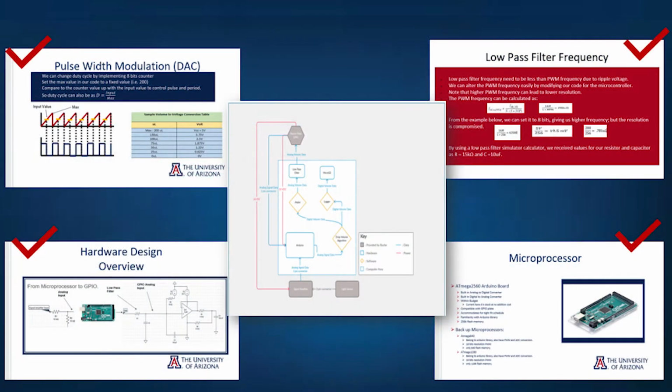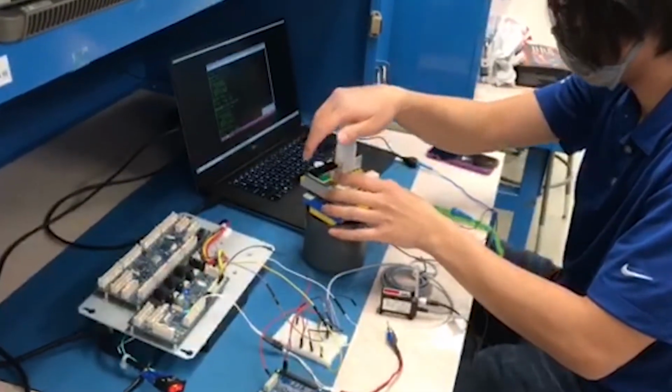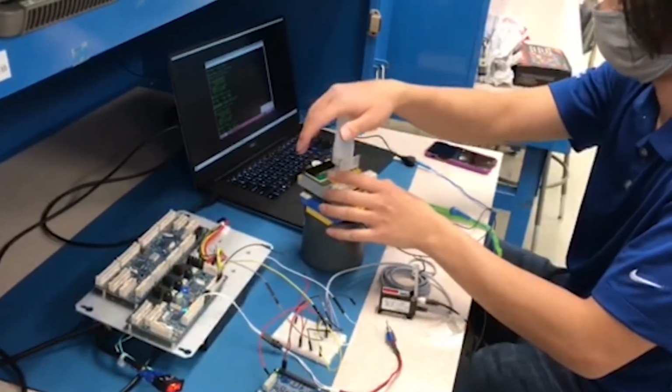Our completed hardware design, with trade studies, a system block diagram, and circuit simulations, is what we presented at ISR2. We then began developing the final system, which integrates the software and hardware portions. This system first uses the tissue dye dispenser as a trigger to start collecting data.